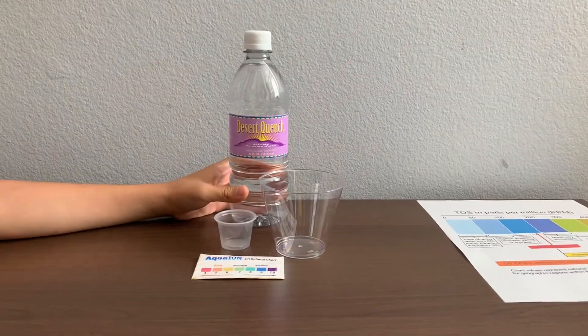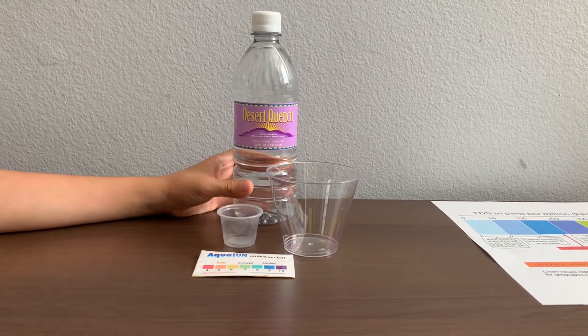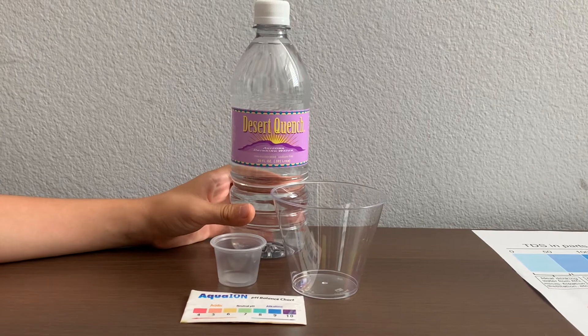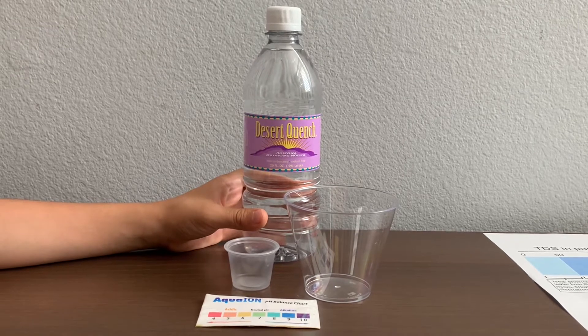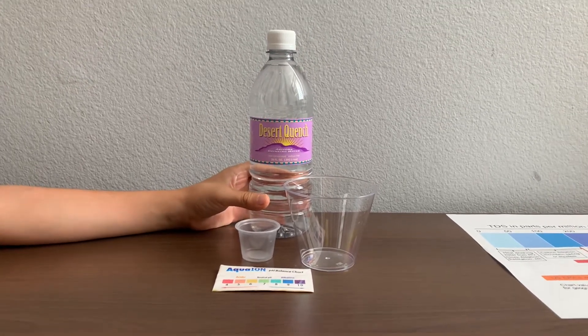This is Desert Quench Purified Drinking Water, sourced from Arizona. This non-carbonated and sodium-free water passed its purification by reverse osmosis. It's sold at the Pilot Market in Arizona, and it costs $1. Let's test the pH and TDS level.